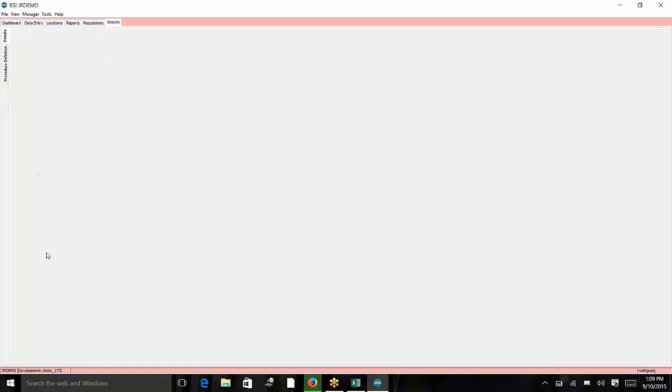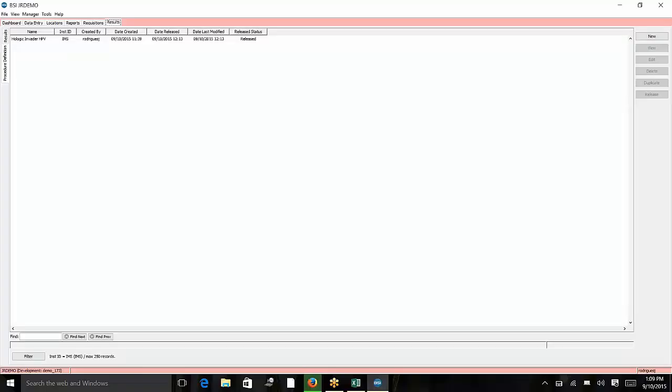So there's a results manager. There's two parts to this manager, similar to subject, how you have your subject data and you also have the background stuff that you set up beforehand with different attributes that you're creating or collecting. For results manager, there's the results information. This is the actual data that you've collected. And there's also the procedure definition. This is how you set up your procedures or experiments beforehand. And when you set them up, you have different components or properties of the procedure. So I'll look at one that's already created.